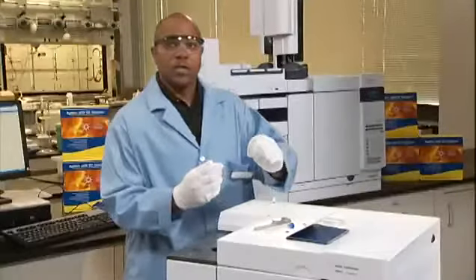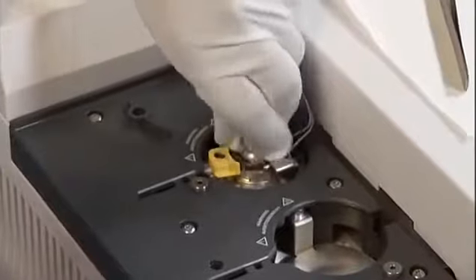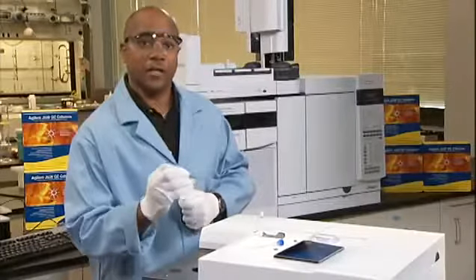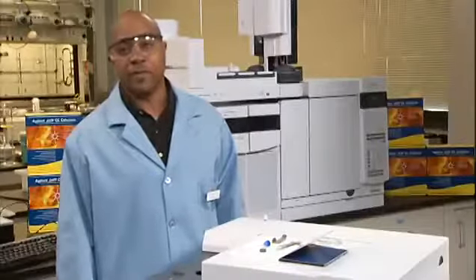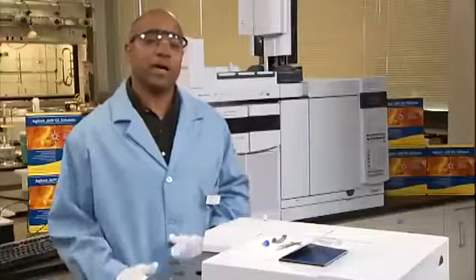Okay, here we go. Loosen the septum retainer nut. Use your tweezers to remove the septum from the retainer nut. Do not gouge or scratch the interior of the septum head. Firmly place the new septum into the fitting. Install the septum retainer nut finger tight.